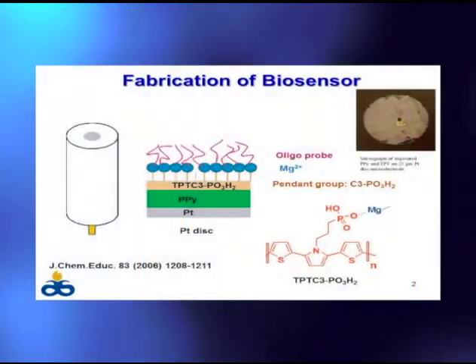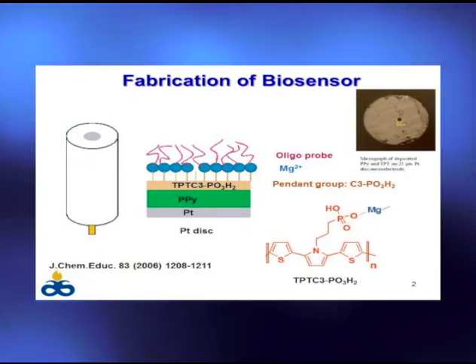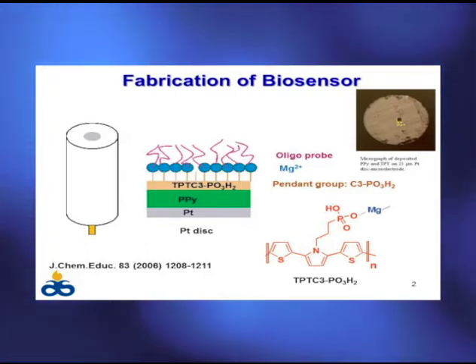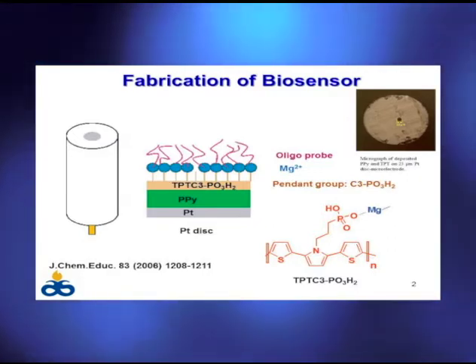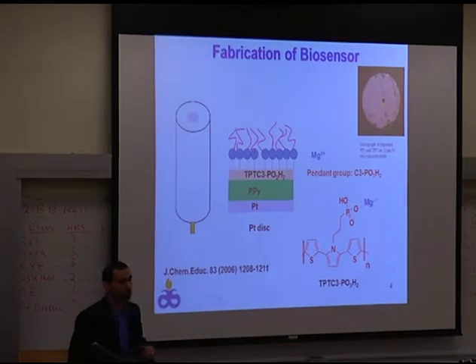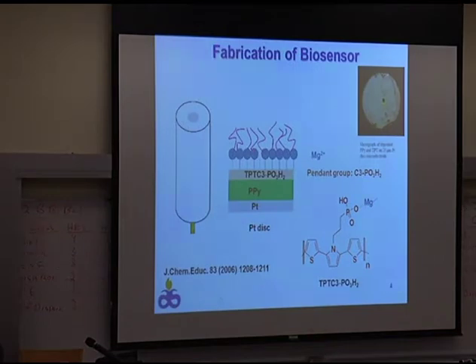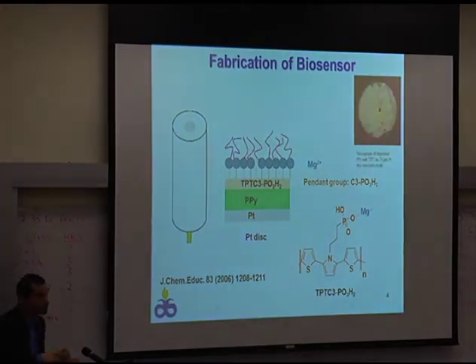Well, what we devised was an electrochemical probe consisting of a platinum disc electrode. First, we worked with relatively large disc electrodes. I'm talking about the scale of millimeters, about 2 millimeters in diameter. And you could see that platinum disc with the naked eye. Then we moved on to 25 micron diameter, 25 microns. Your hair is about maybe 50 microns thick, 50 micrometers thick. Okay. So this is about half thickness of your hair, really thin hair.